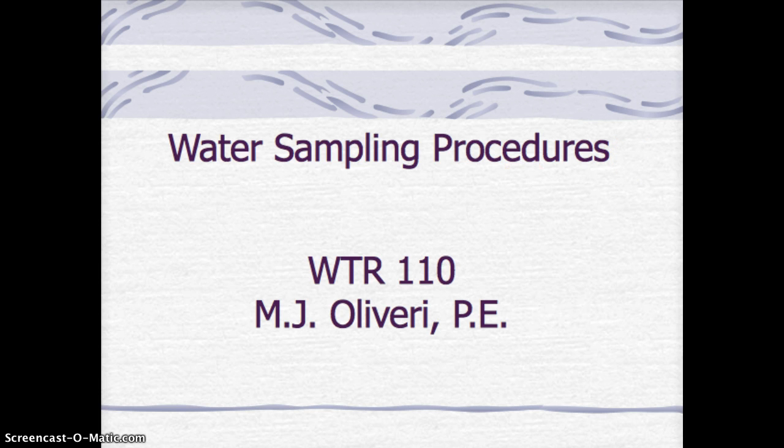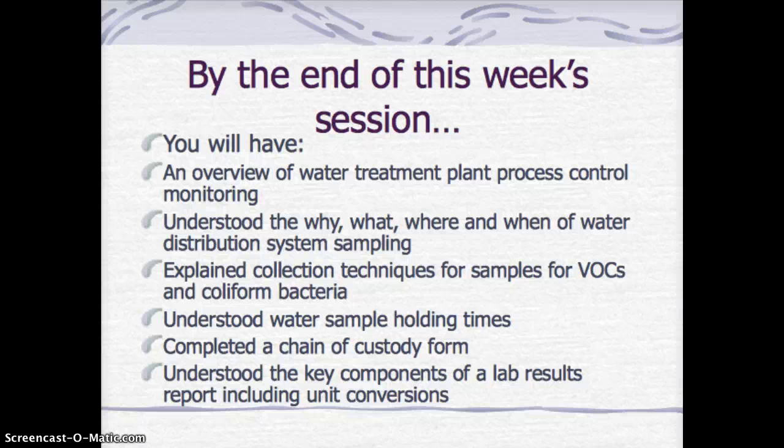Really good. Okay, so this week we are jumping into water sampling procedures. By the end of this week's session, our objectives are that you will have an overview of water treatment plant process control monitoring, understand the why, what, where, and when of water distribution system sampling.